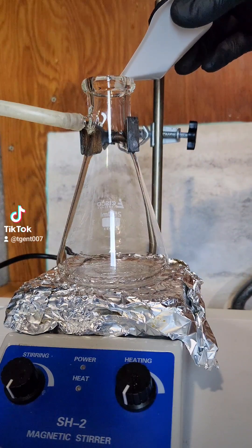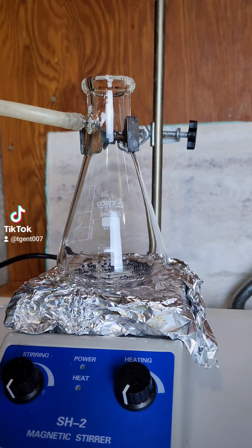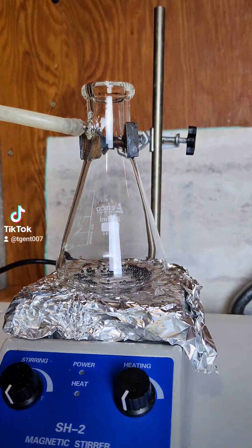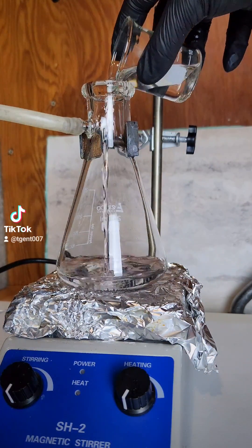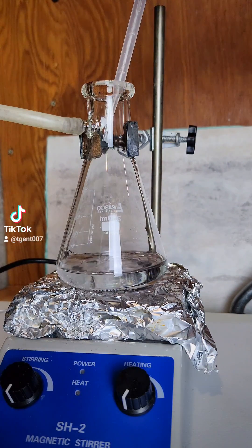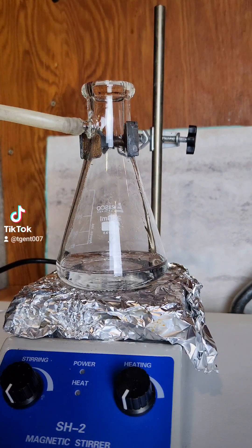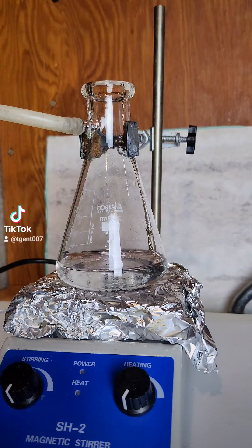Next we need to dissolve the lead metal to get lead nitrate. To do this, I'll add my lead to a filtering flask followed by 50 milliliters of water and 15 milliliters of 70% nitric acid. The flask will be capped and nitrogen dioxide gas will leave through the tube, which is vented outside. I am also working under a fume hood.